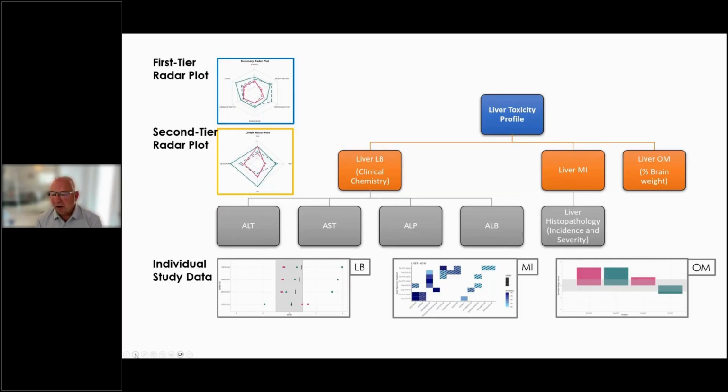As Stephanie pointed out in the beginning, up until the availability of SEND data, this has been pretty much a manual process that individual scientists work through to interpret studies, to inform dose selection for future studies or interpretation of on-target versus off-target effects. And we feel like this tool is a step forward to enable a more thorough and deeper analysis of the data to enable that judgment-based interpretation of the data.